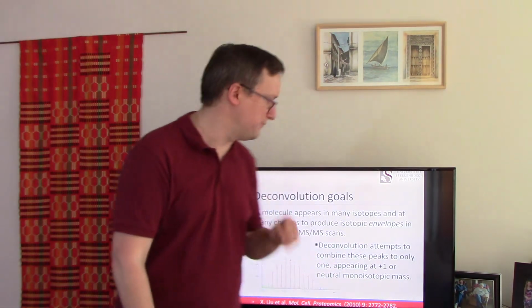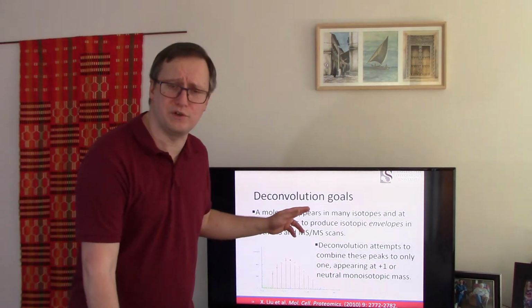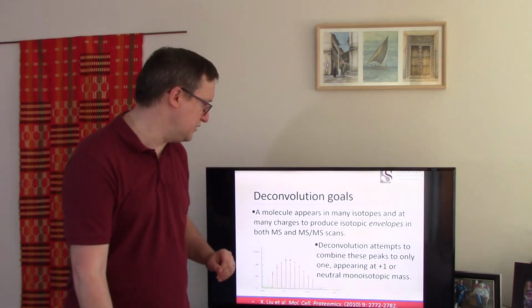That means that there's an awful lot of duplicity in this tandem mass spectrum. We often find that it's very valuable to move all of this current spread out among all these different isotopes and all these different charge states back into one peak to give us greater certitude that this mass to charge value for this monoisotope, at single charge or neutral charge, represents all of those peaks that were sprayed across the spectrum. So deconvolution is the approach that we most frequently use for this.